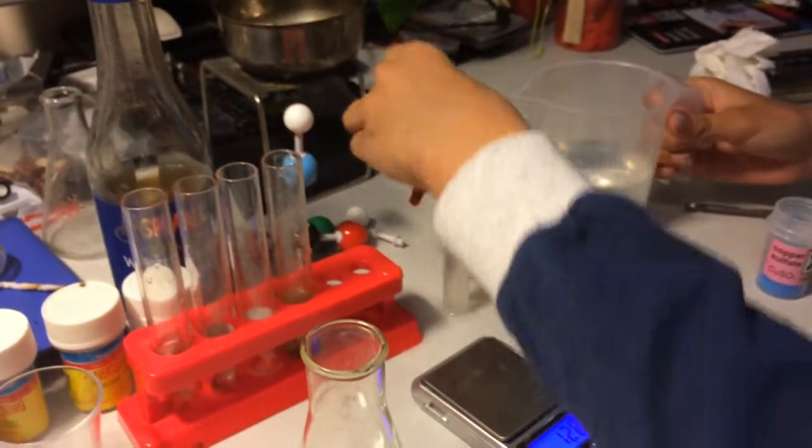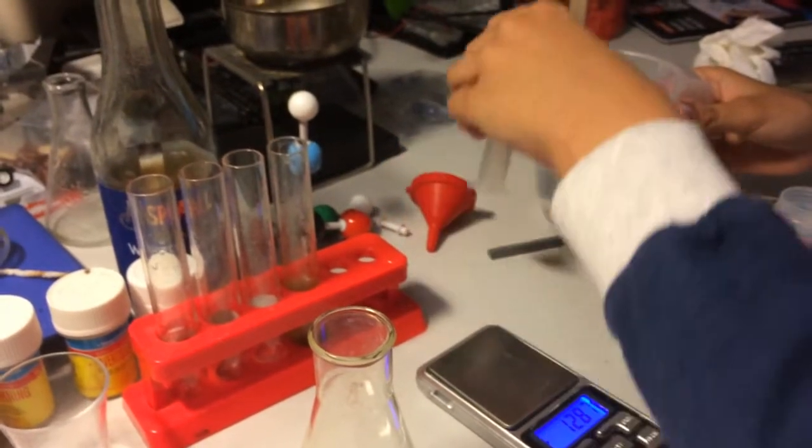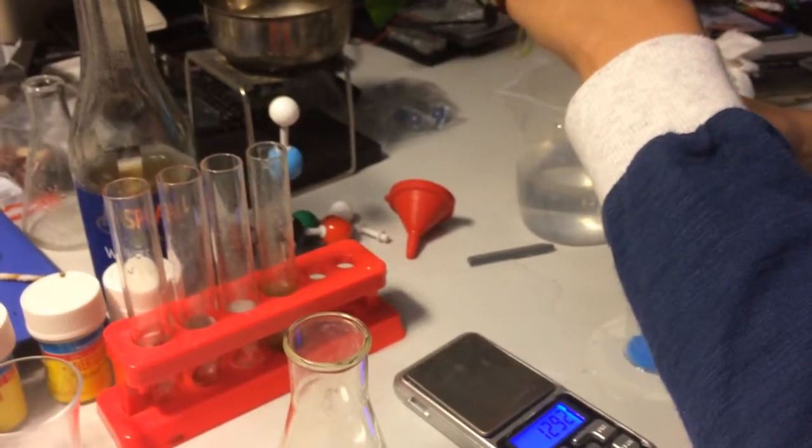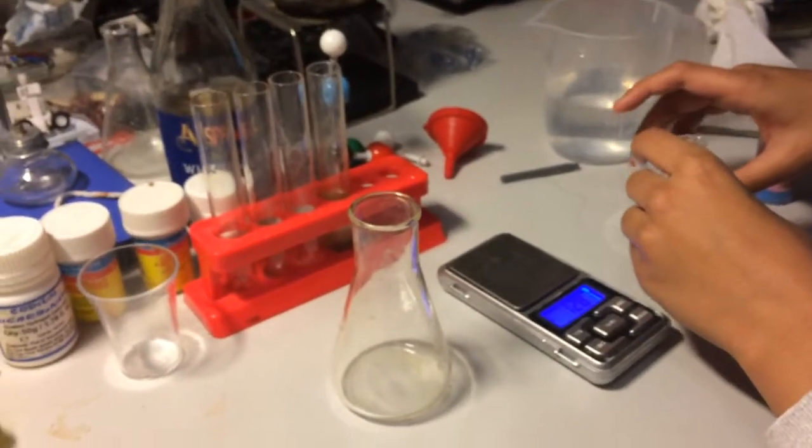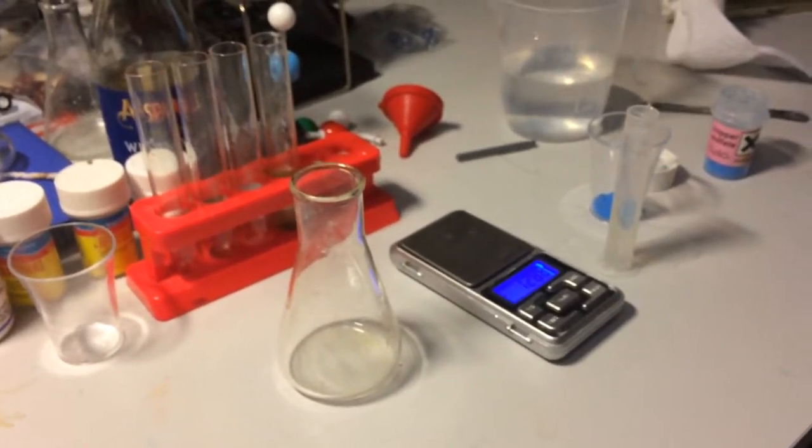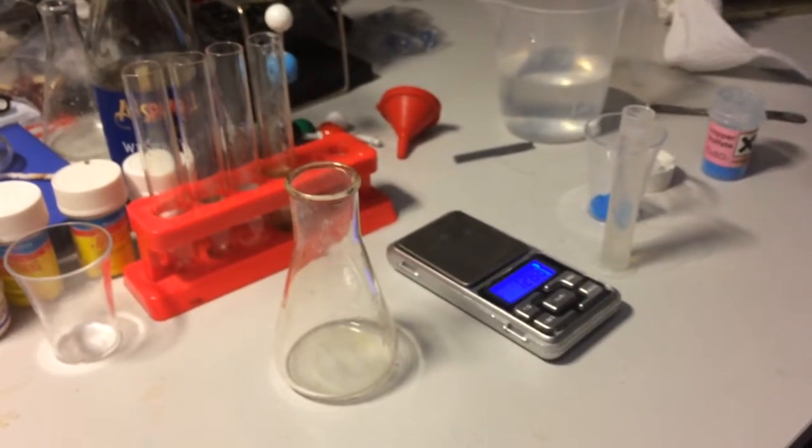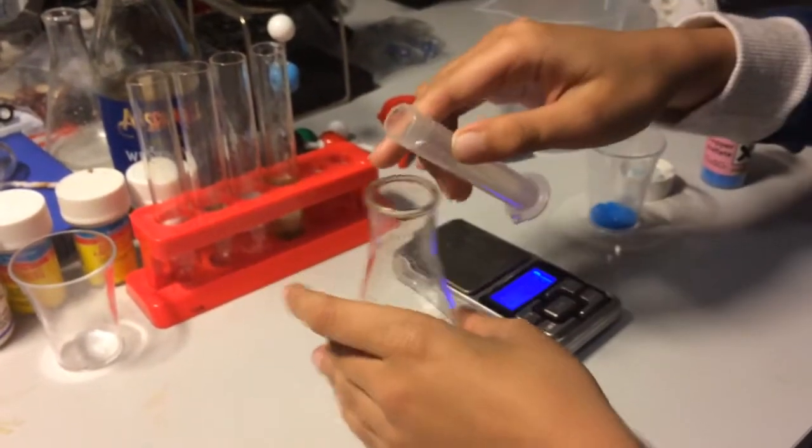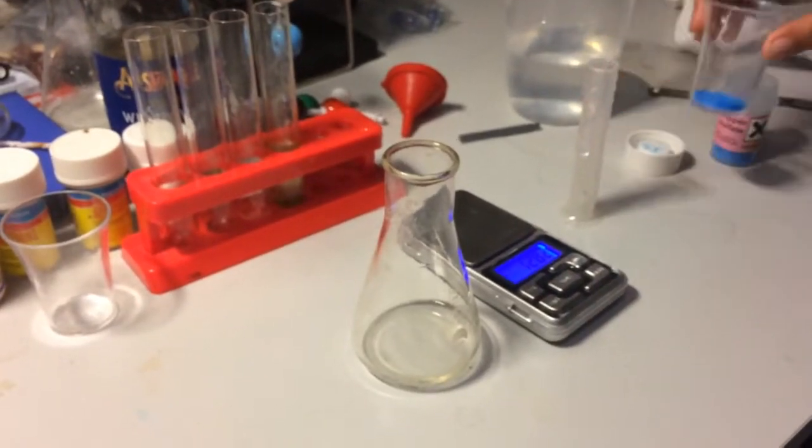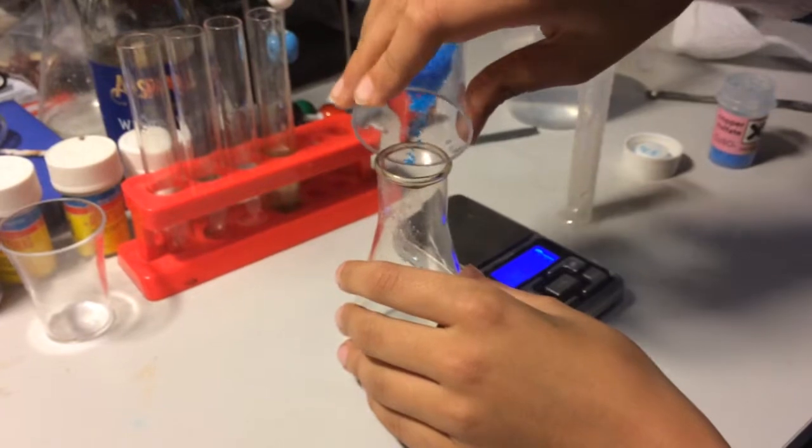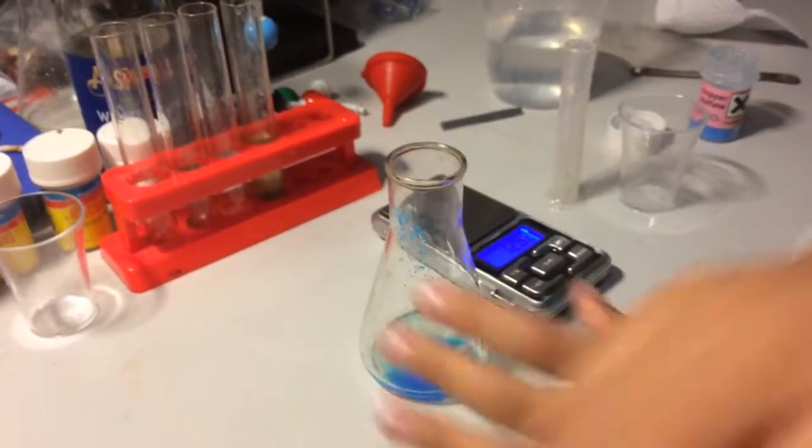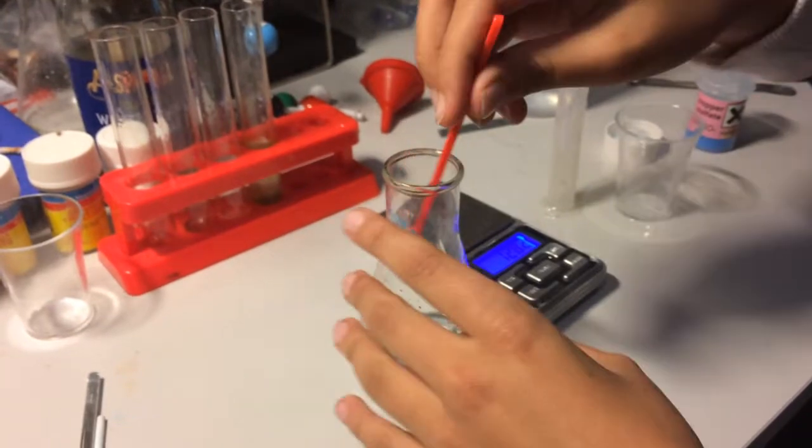If you pour too much, you can just pour it back in. Now that we have 10 milliliters of water, we can now put it in a test or a conical flask and mix it with copper sulphate. Although of course you will need to stir before you do anything else.